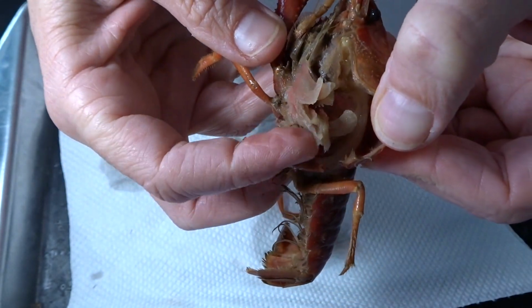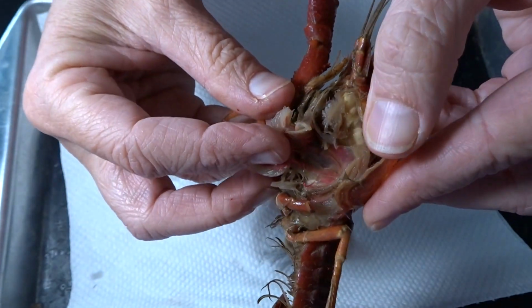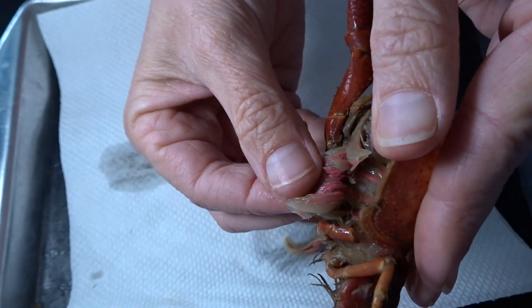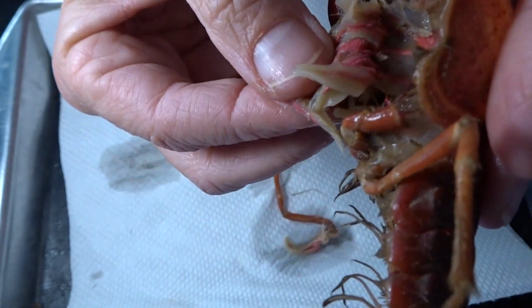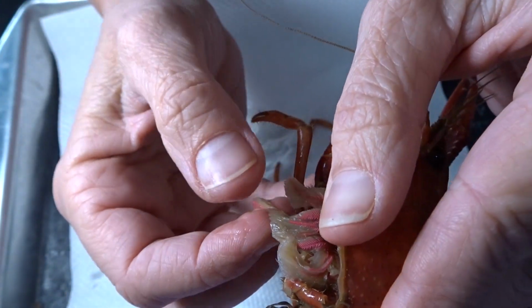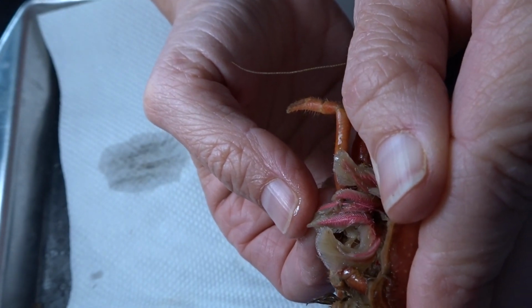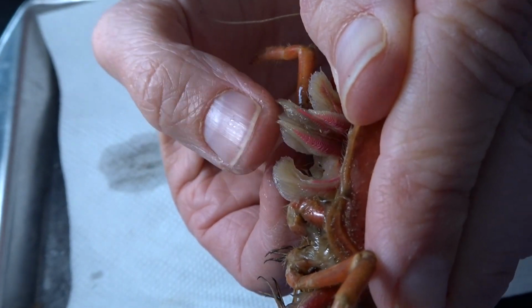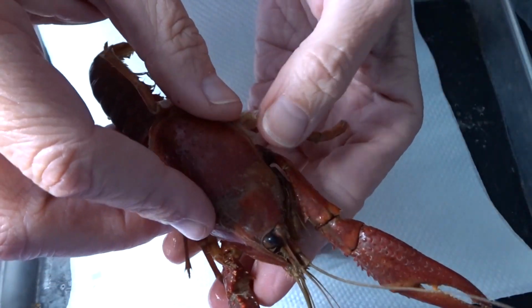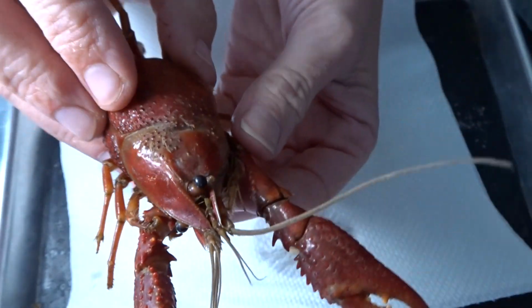I hope this works out okay. If not, there'll be take two. But if you look, you can see, look at all those blood vessels. Look at that. It works out really cool. Oh my gosh, this is probably the best, ow, it stabbed me. One of the best specimens that I've had as far as being injected with latex. You can see it going beautifully through all of the gills, okay? So what works out, what's super awesome about this is they, as a crayfish walks, right?